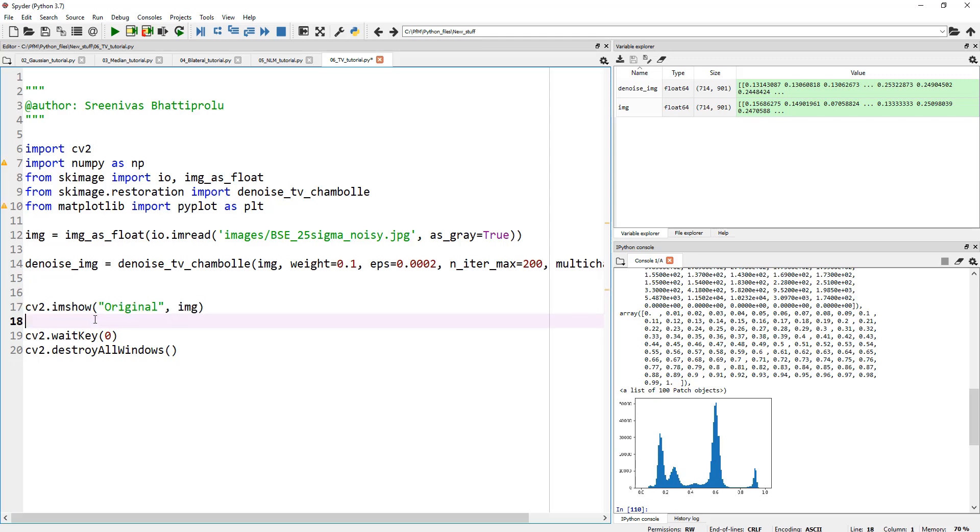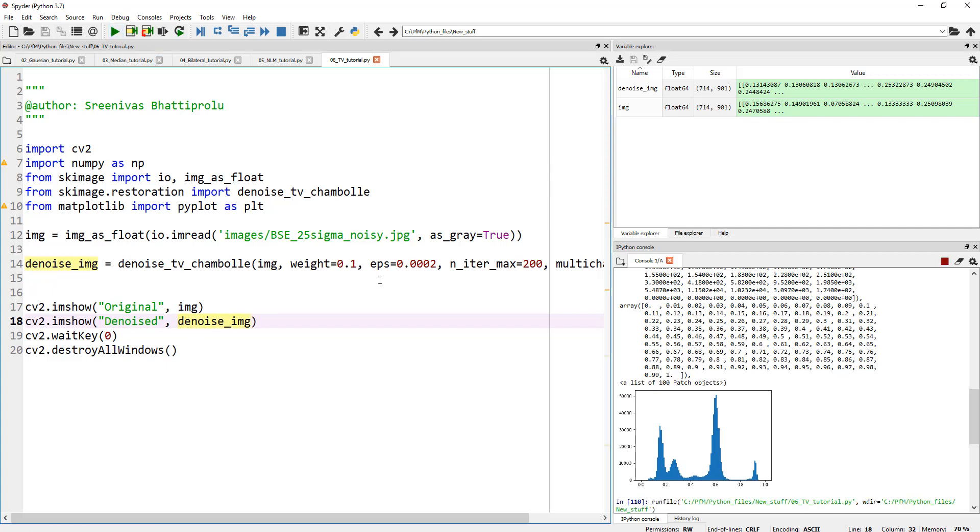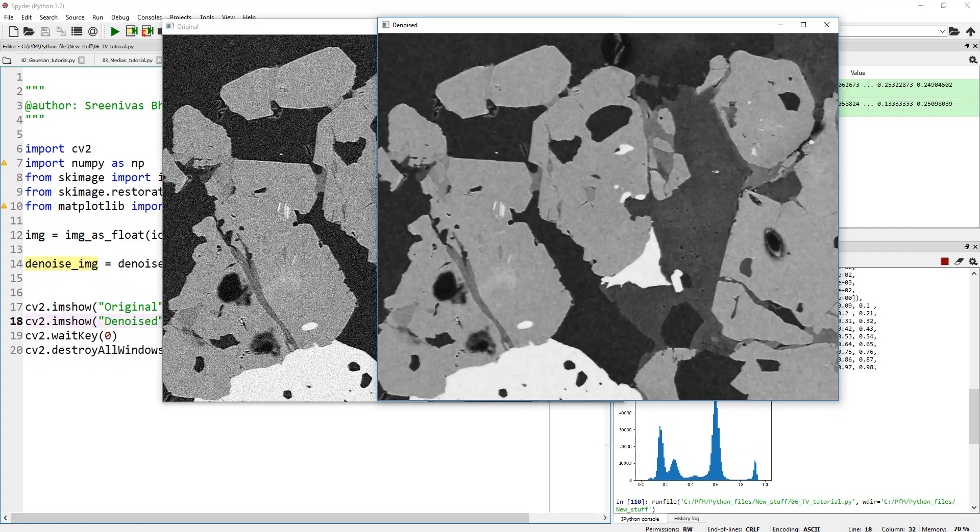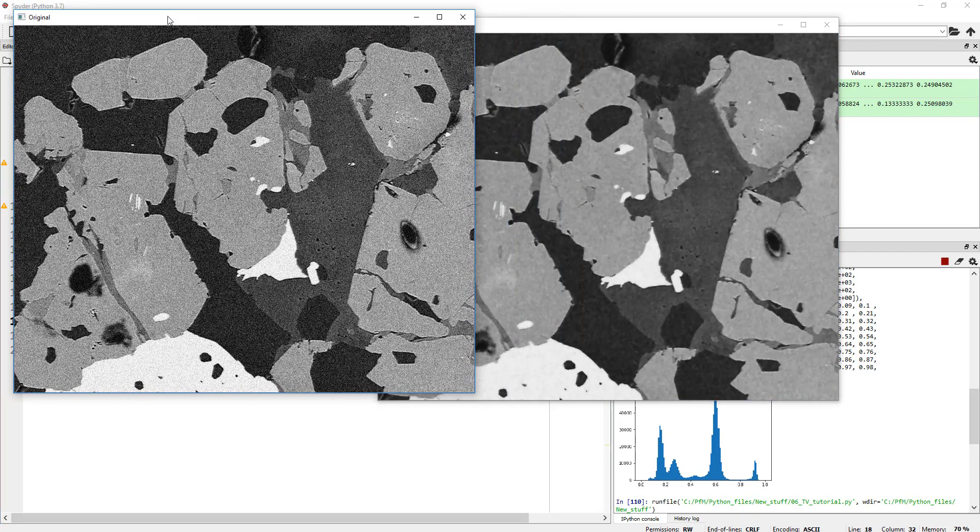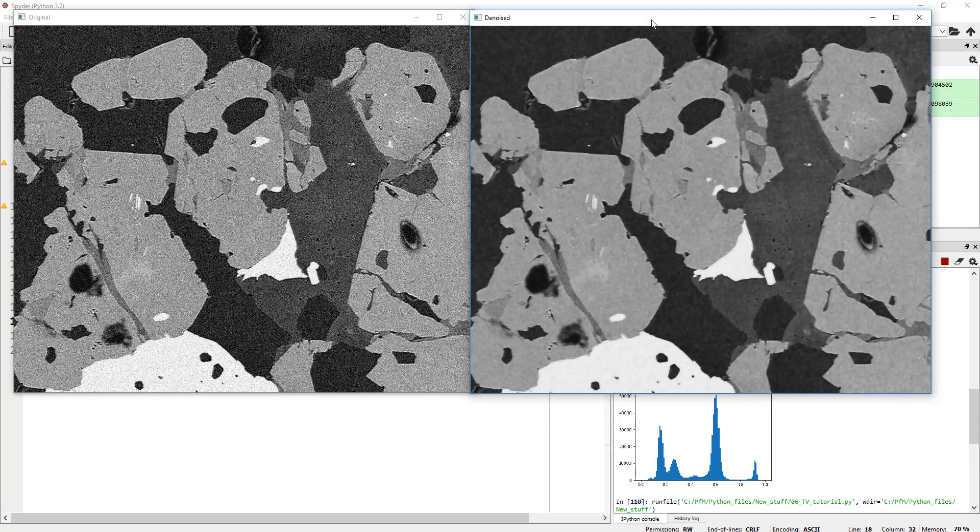So let's actually have a look at our cleaned image. We know that the histogram looks clean. So let me go ahead and this is denoised and denoise image. So let's look at the image before and after the TV cleanup. Here is the original and here is the denoised image. And that looks amazing.